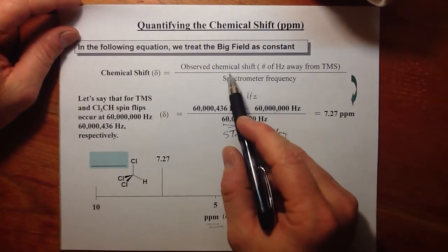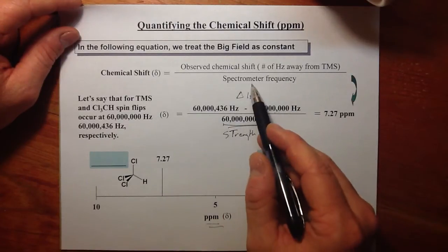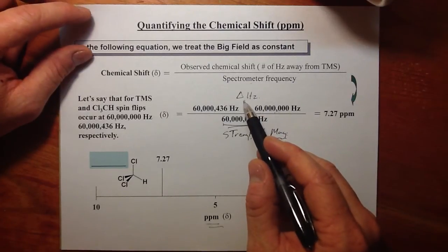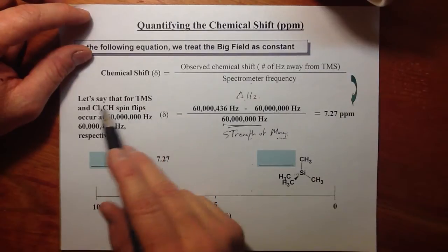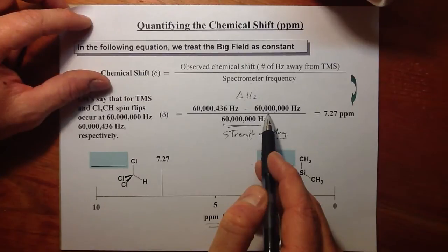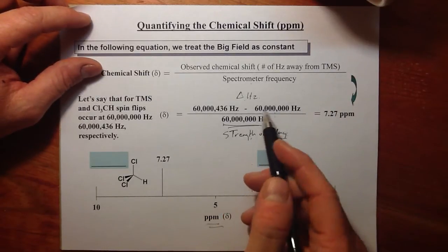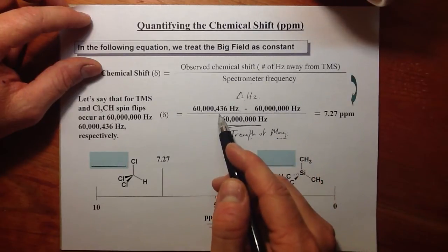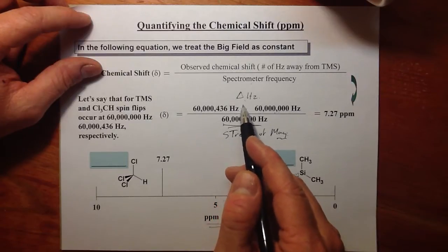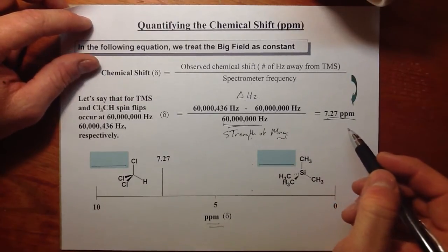So we've taken the observed chemical shift, the number of hertz away from tetramethylsilane, over the strength of the magnet. So let's say that tetramethylsilane and trichloromethane spin flips occur at these frequencies. We have the 60 million hertz. We set that as our zero, and everything above that we of course measure. So we have a very small difference, 436 hertz is our difference, and we divide that by the strength of the magnet, and we get this 7.27 parts per million.